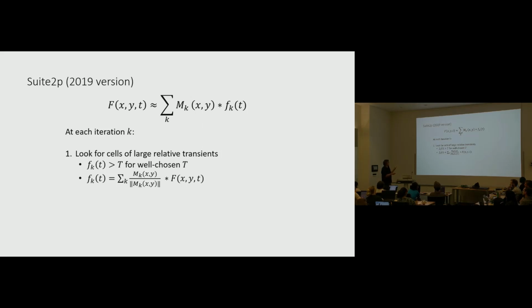And then with this estimated F, I can go in and ask if it crosses a threshold and on how many frames it crosses that threshold. I initialize a new ROI there. Actually, it's with a square rather than a circular blob, just for efficiency reasons, to be a lot faster. Doesn't matter so much. It's just the initialization. And then after I've initialized it, now I can iterate within this equation, at this position to get my best estimate of F and M together.